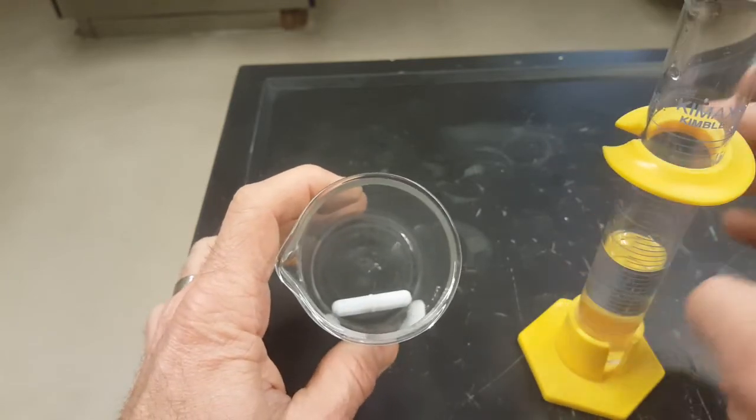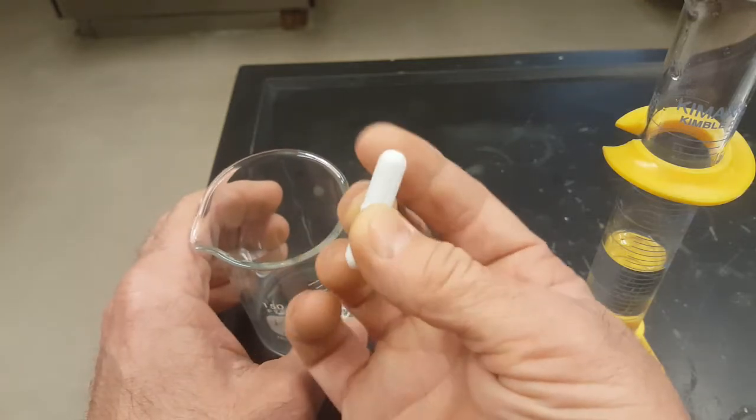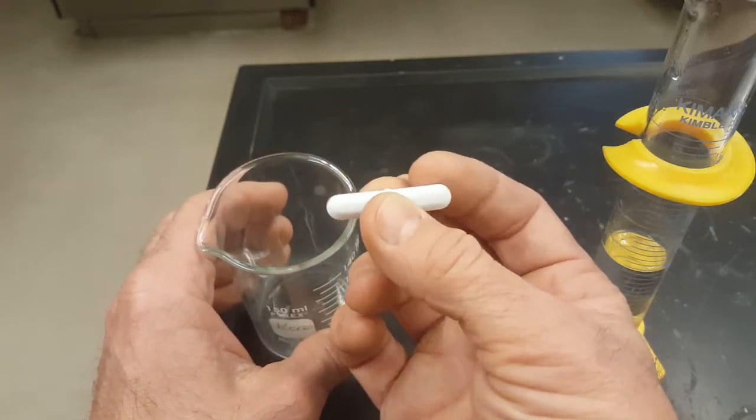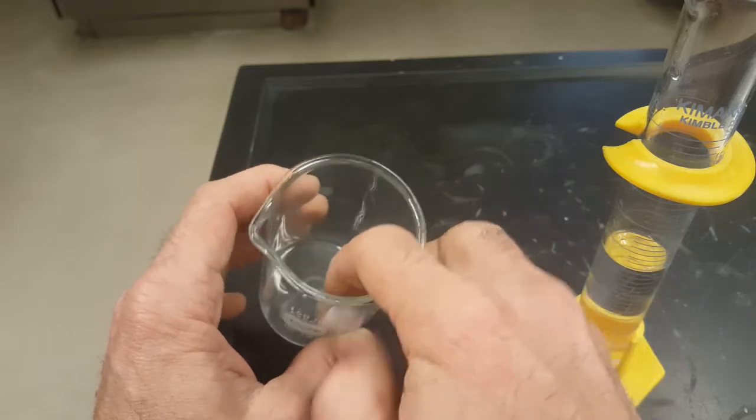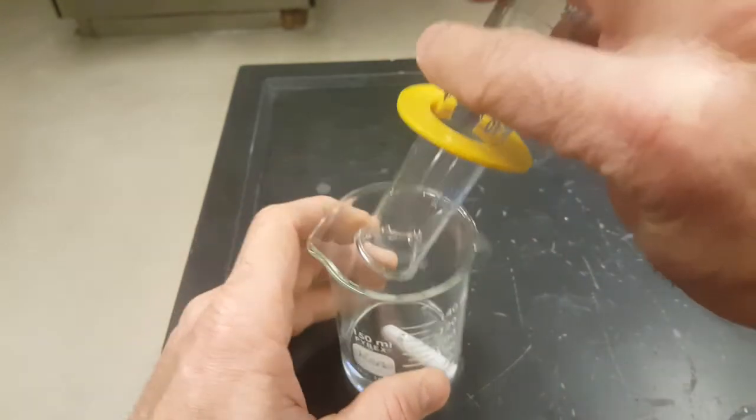And there is a Teflon coated piece of iron down here at the bottom. It's called a flea, and that's for stirring. And so you'll pour your acid in.